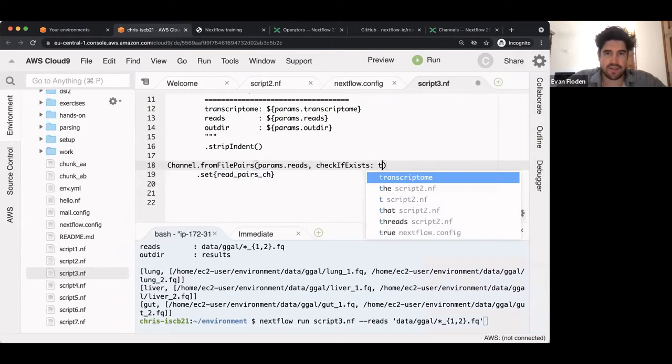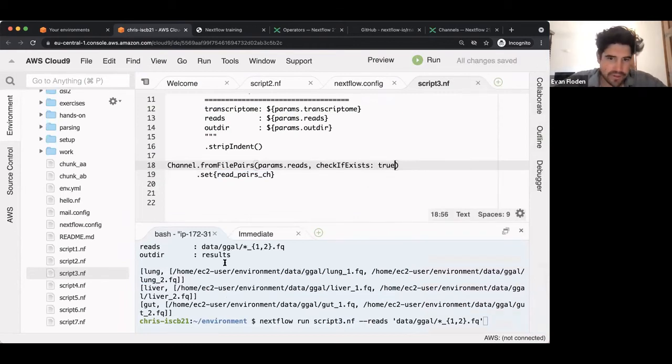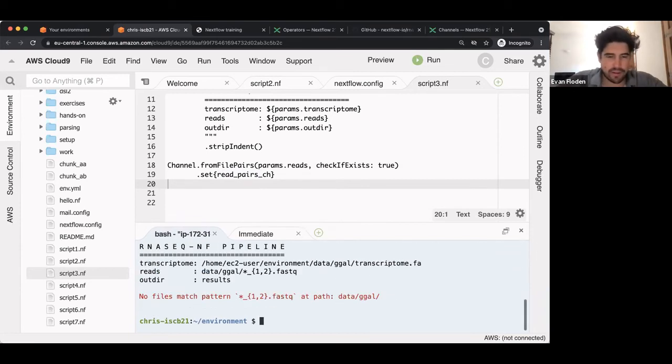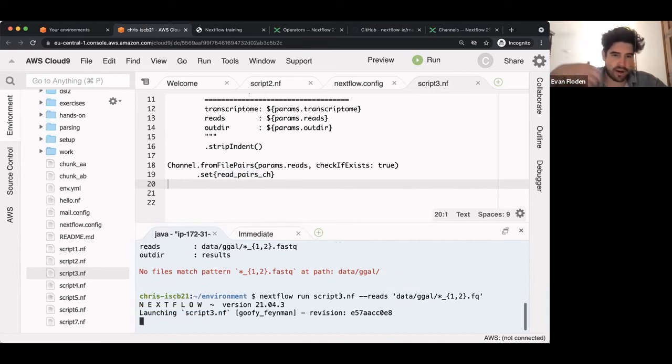Now, and this is something that happens all the time, I've just saved that, and if you look at the screen below, imagine that instead of being f.fq, I thought these were like fastq, say. Typical mistake to make. Imagine I submit this to my cluster, walk away, think it's all fine, and come back in the morning. Well, in this case, I would know straight away that there's a mistake. It would prompt me before it would even submit anything, because nothing matches that pattern. I would quickly fix this as opposed to launching it where it may take some time to fail.